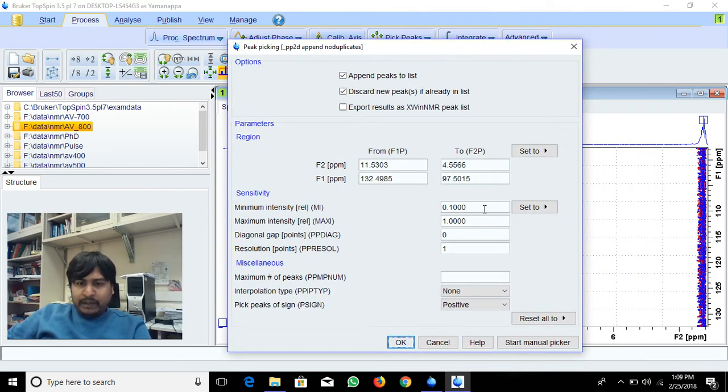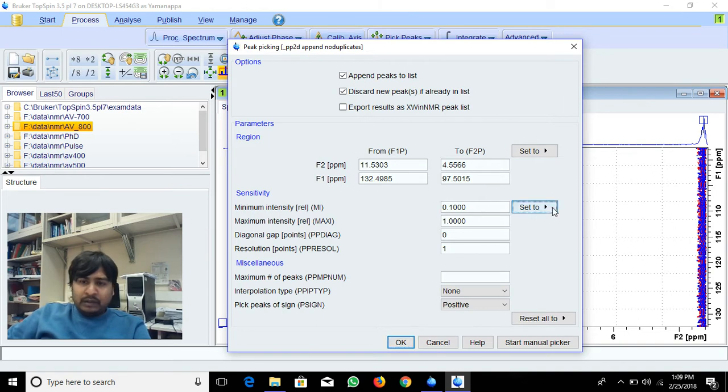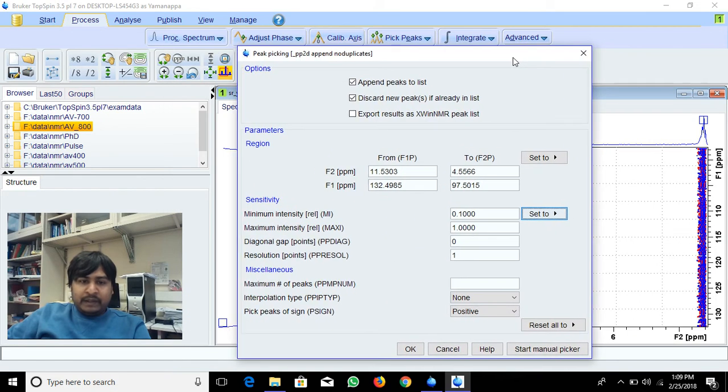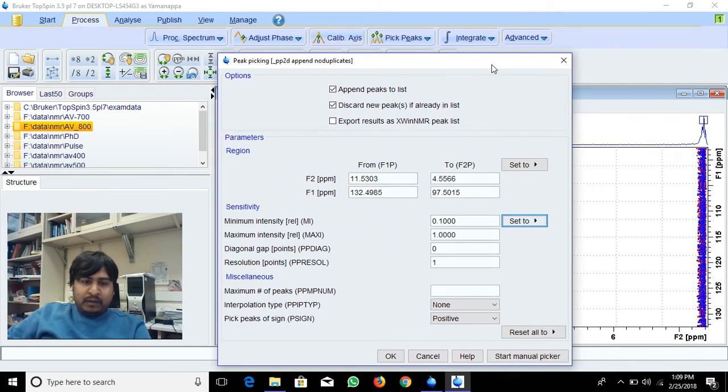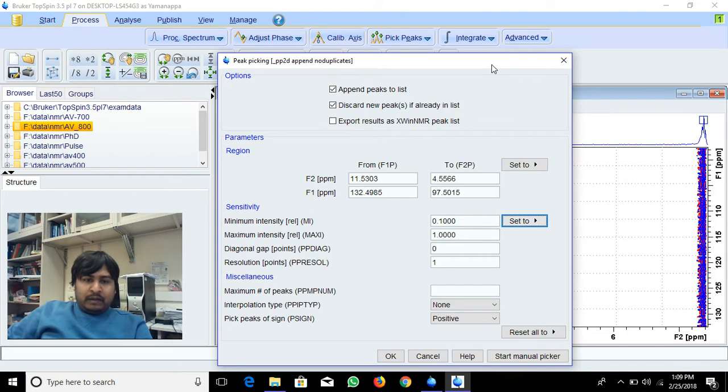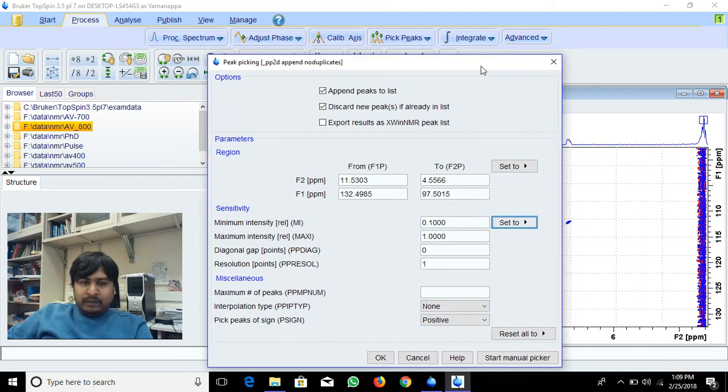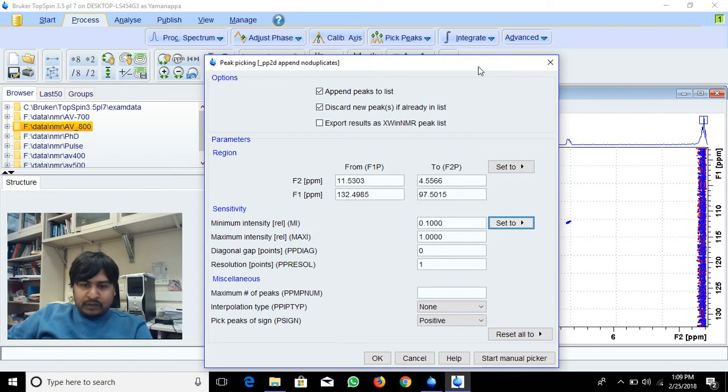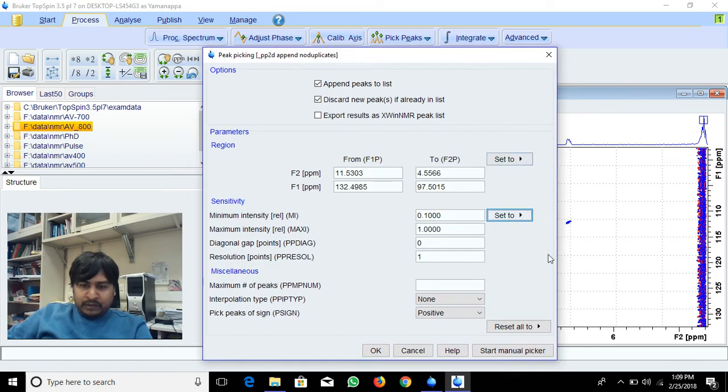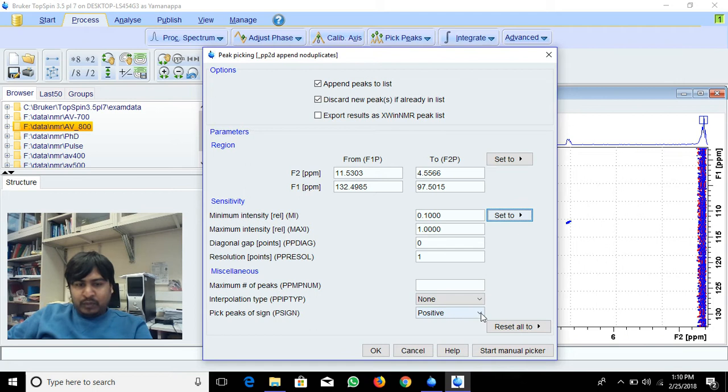Also, minimum intensity, you can give a threshold to avoid picking noise. Minimum and maximum you can increase so it will adjust accordingly. Resolutions and everything adjusts. Pick peaks sign only the positive, or if you want to pick negative also you can select negative, positive, or all.